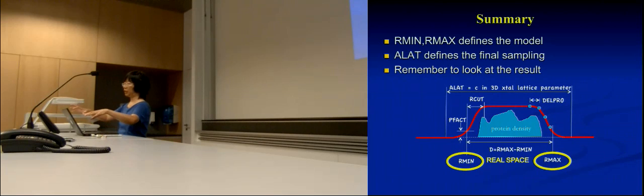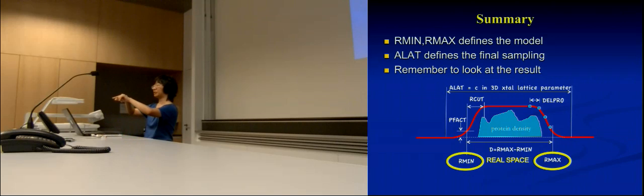So when you get to this step, you do give it what your symmetry is, because when you merge, you gave it symmetry already. So you look at your lattice line, or how your data is populated in the whole z direction. You're going to see inversion around 0. For example, you're going to see that your phase on this part goes this way, and on the other side of 0 in the minus direction, it goes that way in exactly the same way. So that's an indication that you have a symmetry that you didn't apply in there. So that's one of the things that will help you.